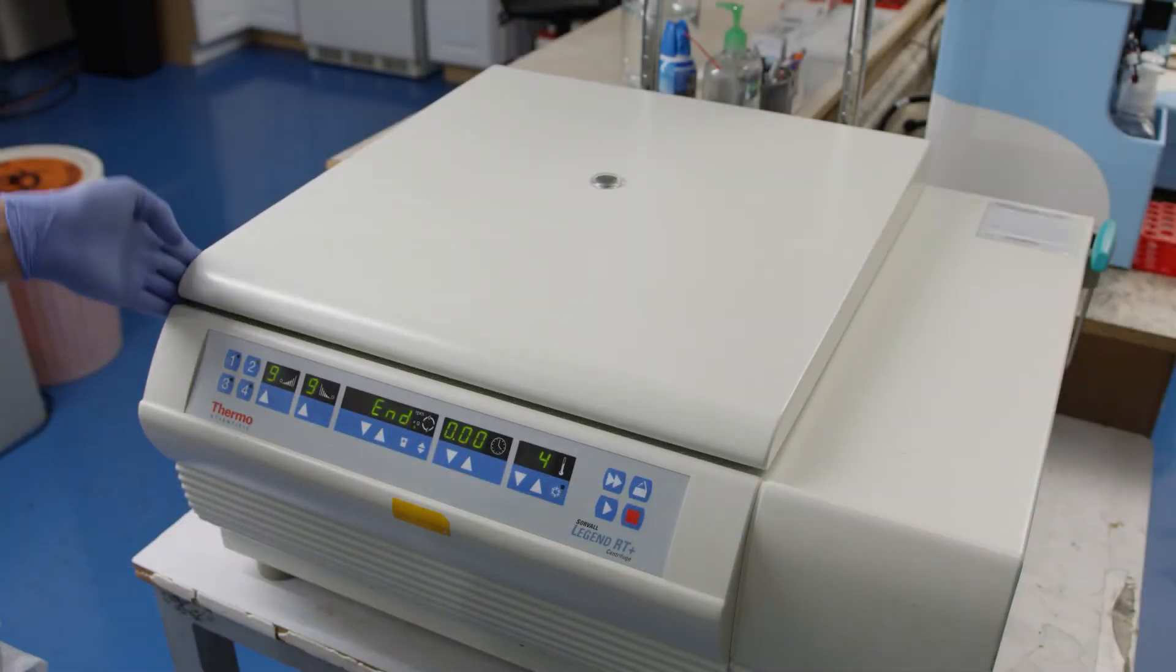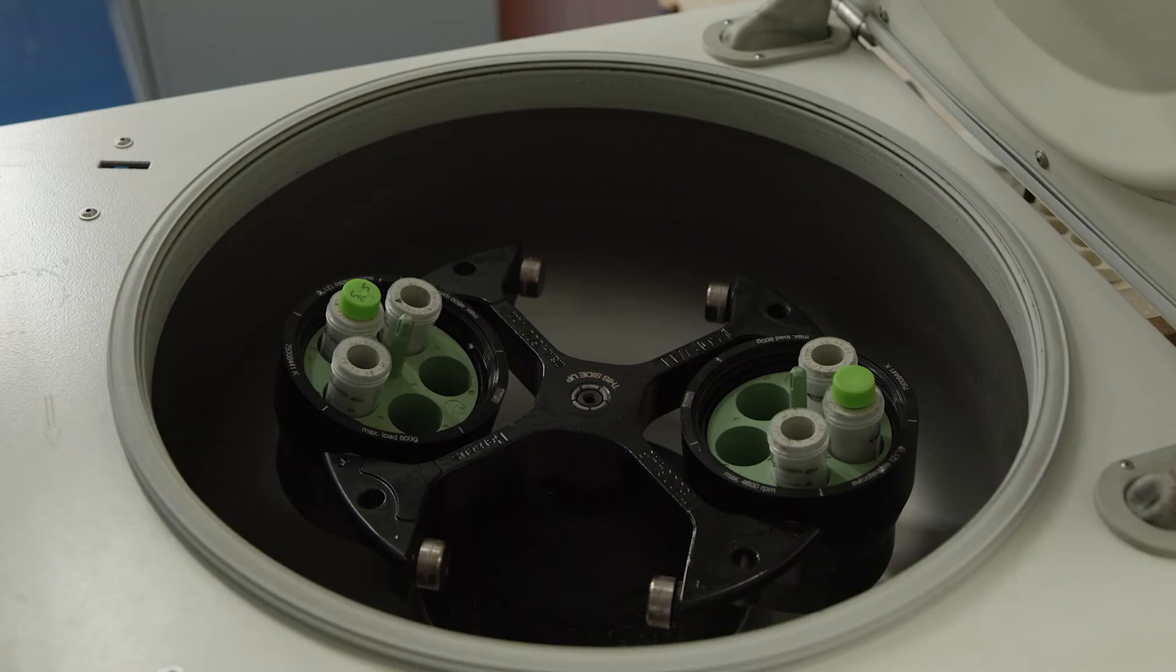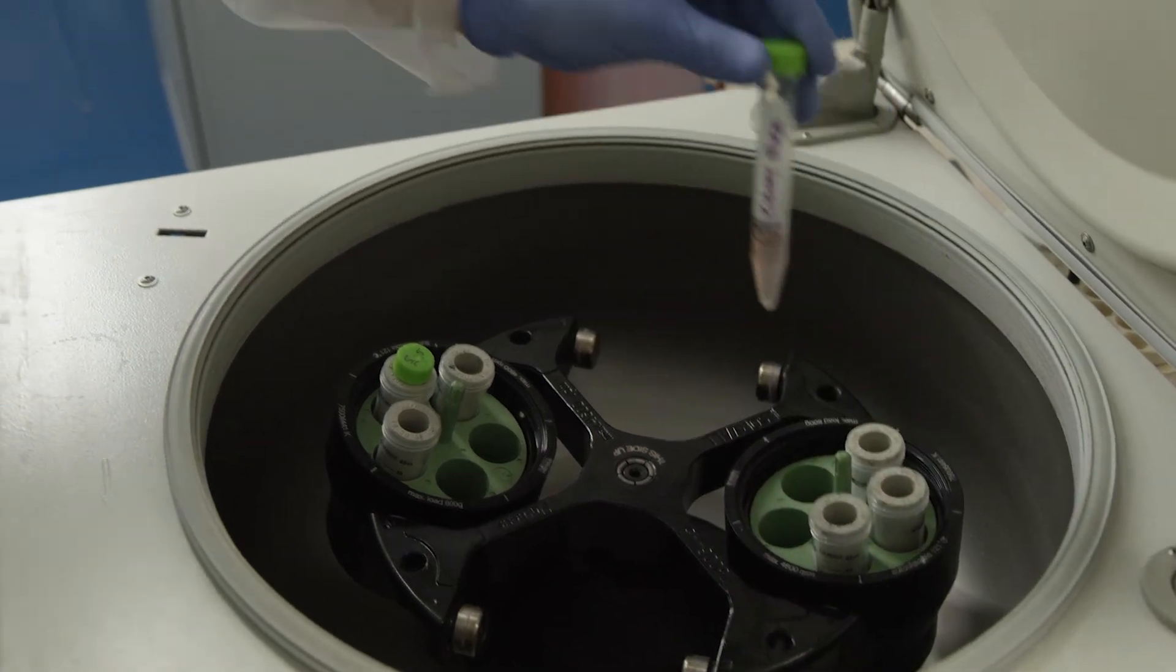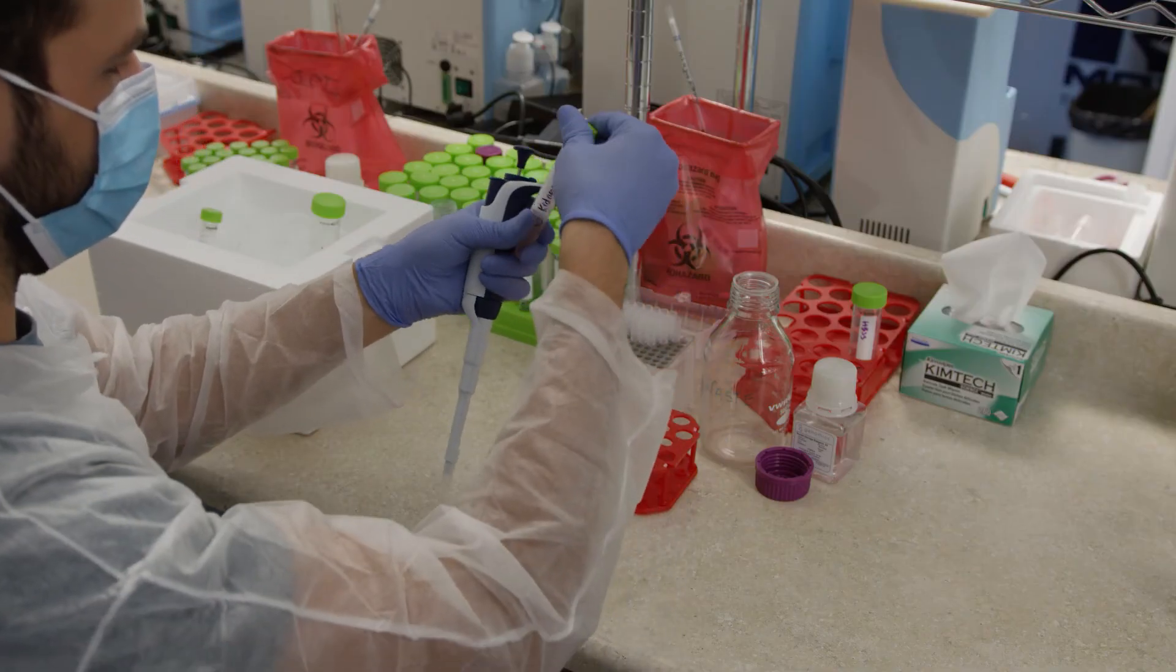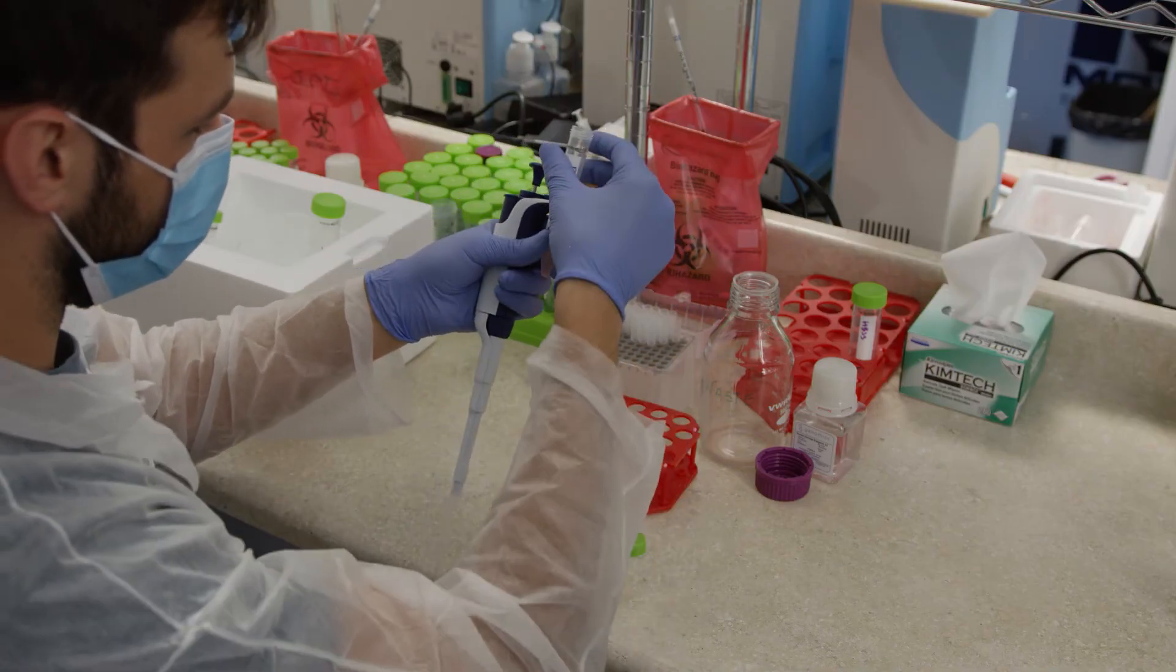After centrifugation, carefully remove the supernatant without disturbing your pellet. Add 1 milliliter of NSR or alternate buffer and gently resuspend the pellet.